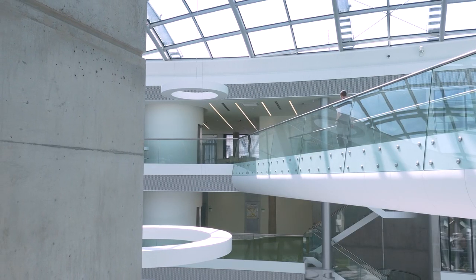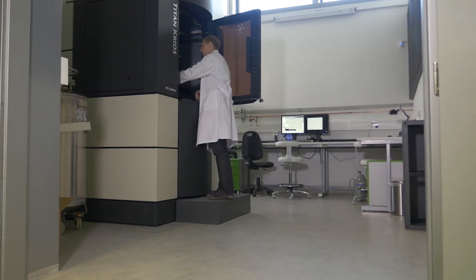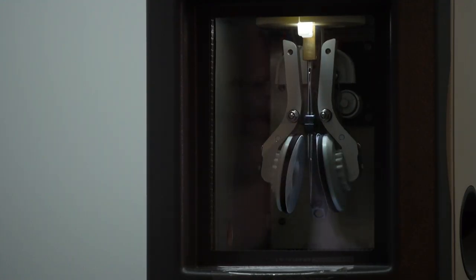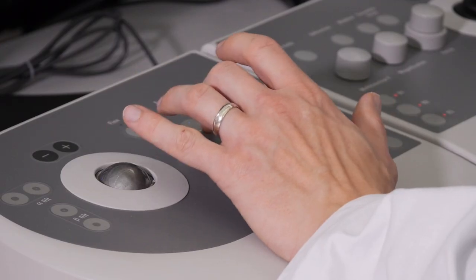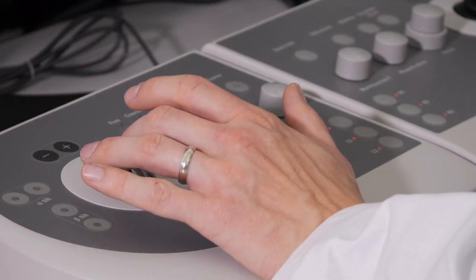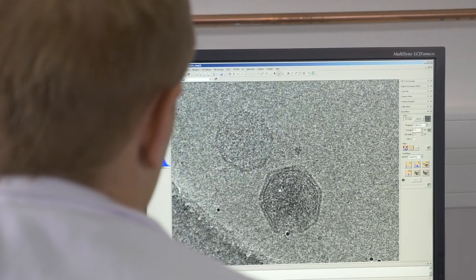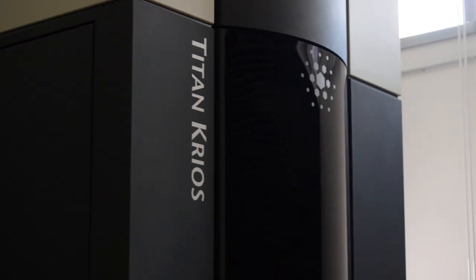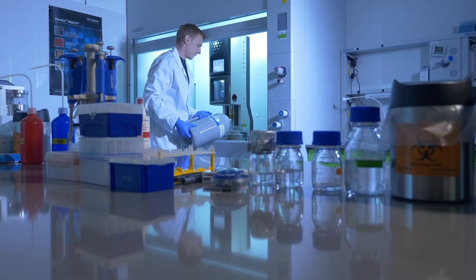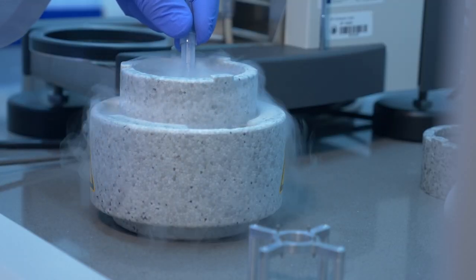Wait, I know it here. This is CEITEC in Brno, Central European Institute of Technology. Yes, there is a Cryo electron microscope here with a special function. It can work with biological samples. They would soon be dehydrated by the vacuum in the common electron microscope and thus would be destroyed for the research. However, FEI has developed a system where each sample is permanently frozen to at least the temperature of liquid nitrogen from its production to its examination in the Cryo microscope. I understand. Thus, the damage is prevented.